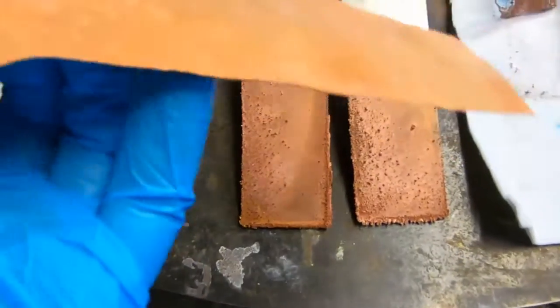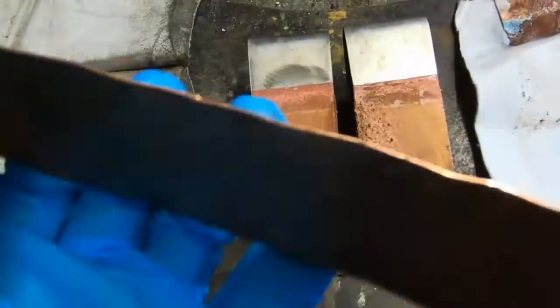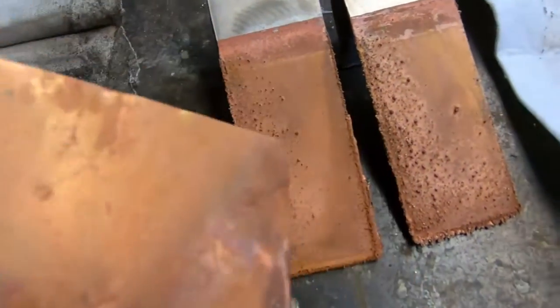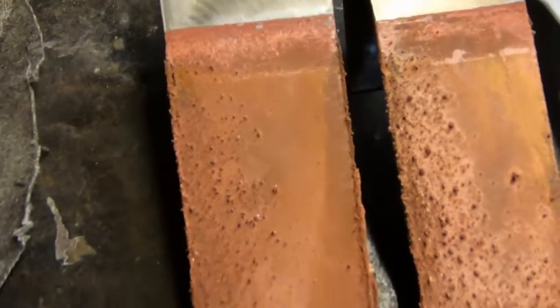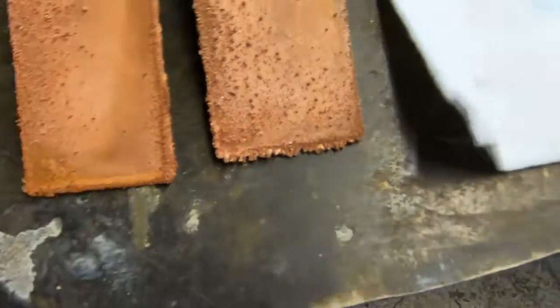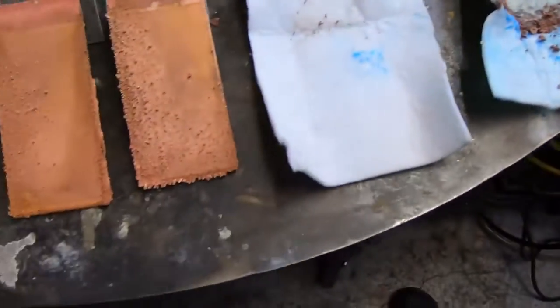But if you'll notice, our e-waste anode is not the same on both sides. We have a smooth side, which I wish I would have taken note of in the next test, and we have a rough side. I would propose that this cathode was exposed to the smooth side of our anode, and that cathode was exposed to the rough side. I may have folded this in such a way that both sides were smooth, and I think I did. So that could be completely moot. It appears I did do that, but it's hard to tell with so much gunk on here at this point. I'll double check in the video. We'll be able to see later on.